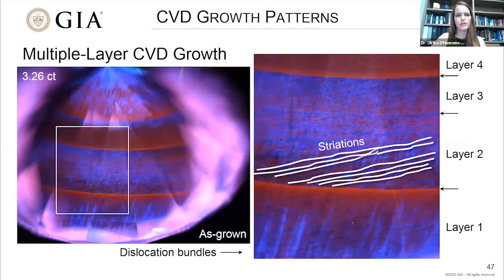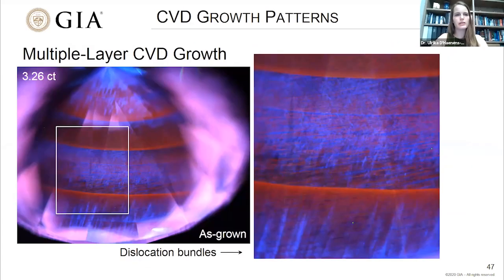So as a frame of reference, here you can see the sizes of these stones. Really this magnification is just of the order of sort of 20 times or something along those lines for the diamond view instrument. So you can oftentimes observe the patterns using that type of magnification. But here we're using very intense high energy UV, which is dangerous to the eye. So you can't do it, say, using a microscope and a UV light. This has to be done using a specialized enclosed instrument, unfortunately.